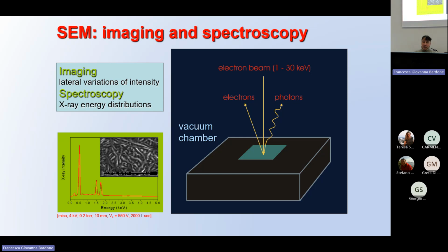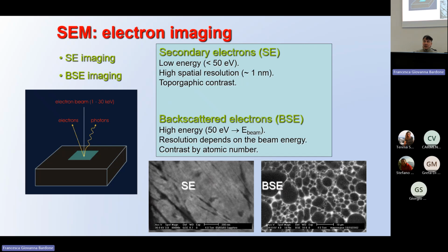These are called secondary electrons. So there are specific engineering devices which collect these secondary electrons. How are these secondary electrons defined? Remember this physics here. Secondary electrons are defined as electrons which escape the surface with an energy below 50 electron volt. Very, very small energy.